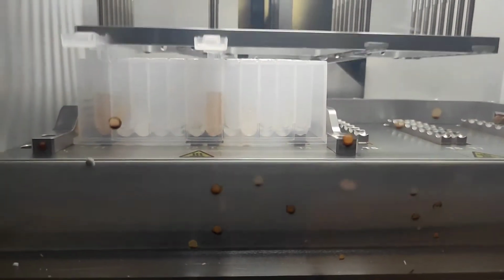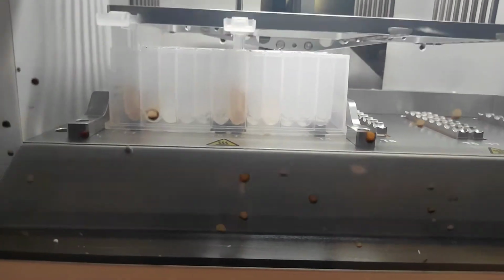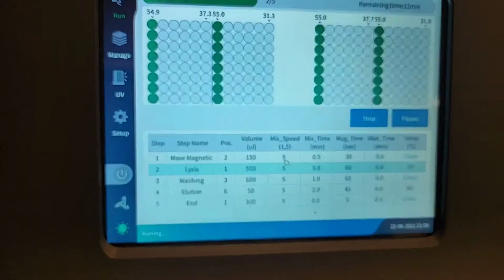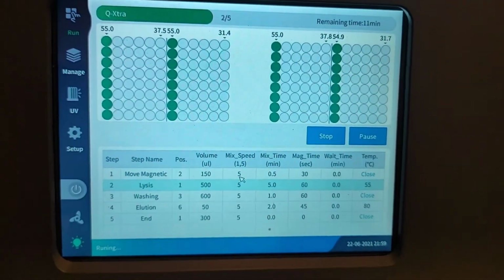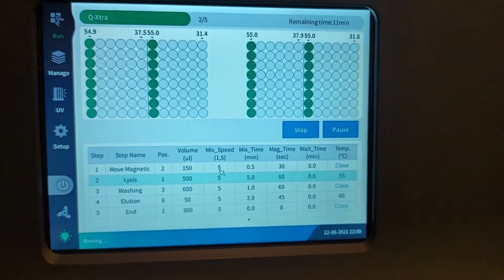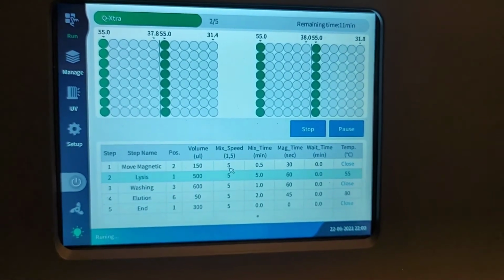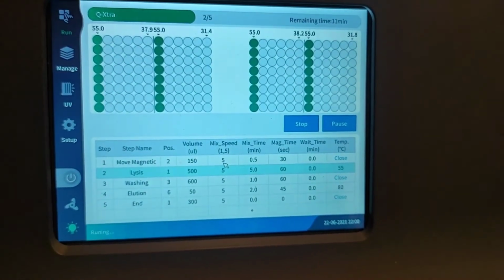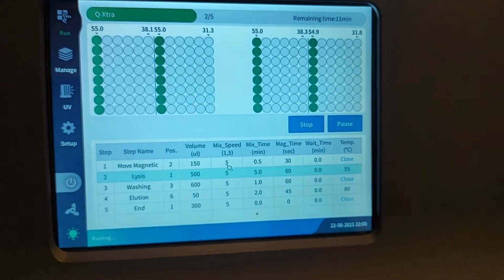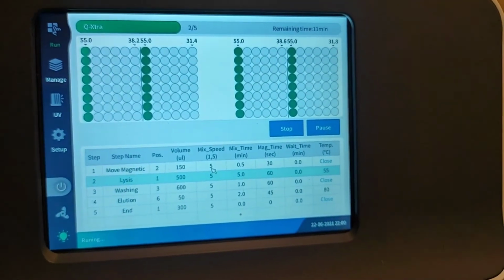So the extraction plate is already filled with magnetic beads, lysis buffer, elution buffer, and wash buffer. As you can see here in the display, right now lysis is going on, so it will take about 5 minutes. And you can see here in the diagram, the first row and seventh row are filled with green color, so it means the process of lysis is going on in the first and seventh row of the plate.